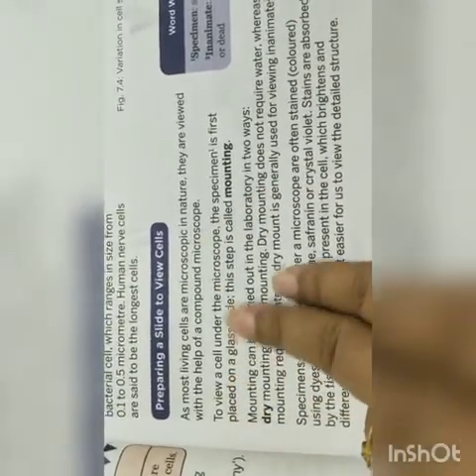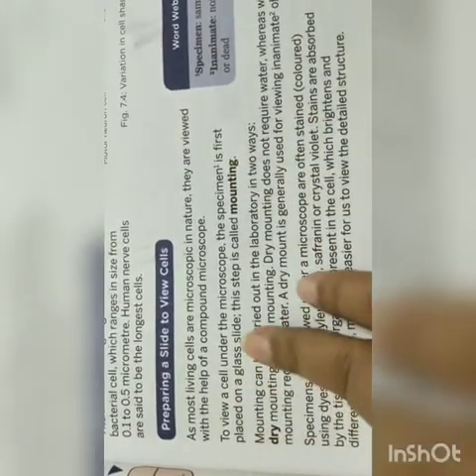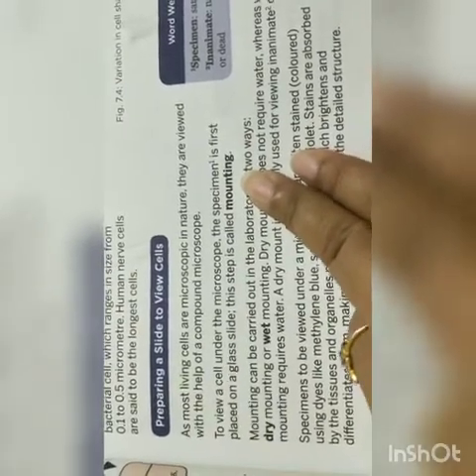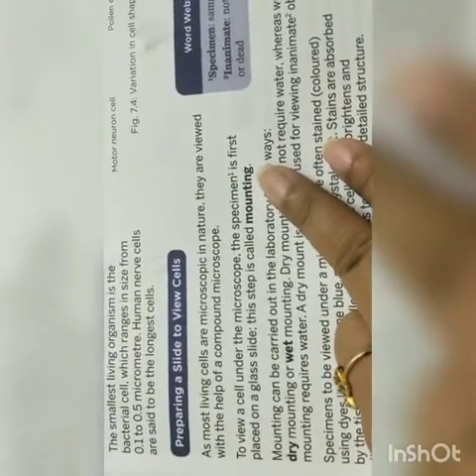To view a cell under the microscope, the specimen is first placed on a glass slide. This step is called mounting. Specimen means what? The sample, whatever sample we are taking.